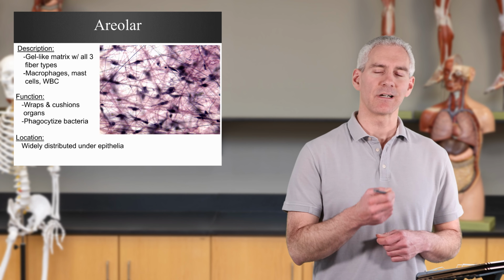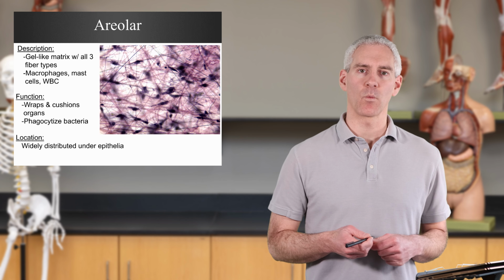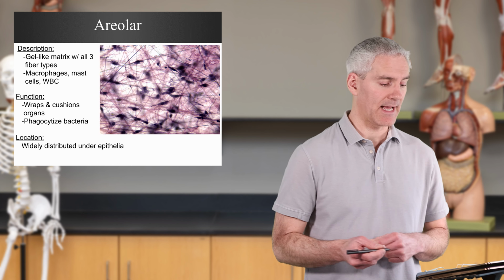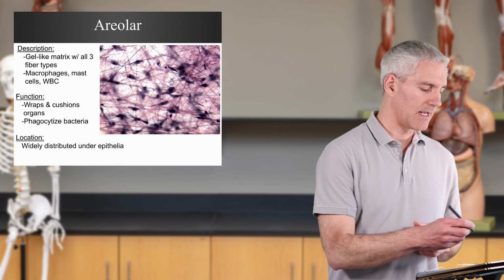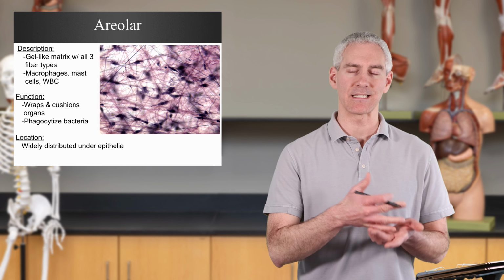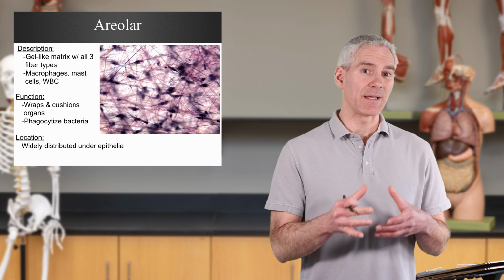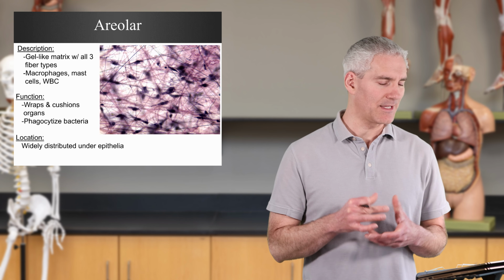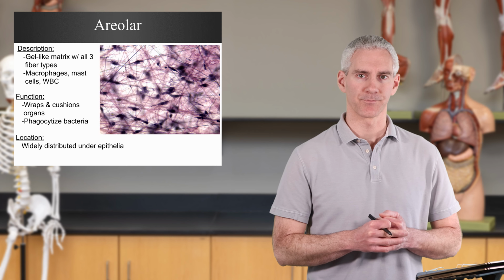Those are going to be the thinner, more reticular. And then we have the dark ones, elastic fibers made of elastin. Here's one right here. You can see the color difference helps with identifying that's more of an elastic for elastin. The way we identify is by seeing all these fibers in this really haphazard jumbled mass that is areolar tissue.